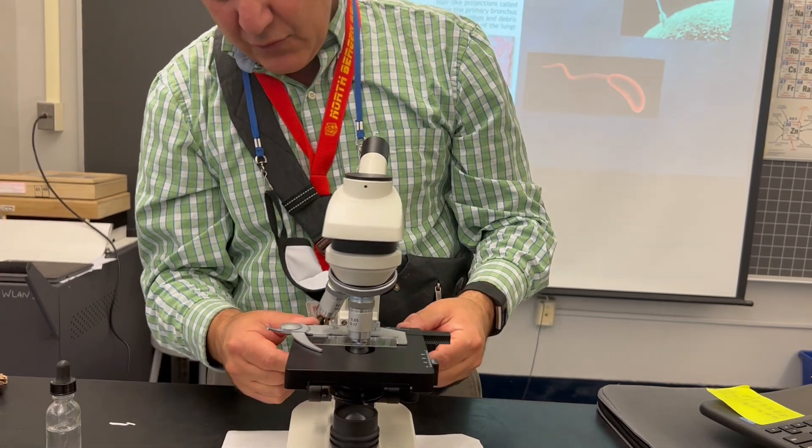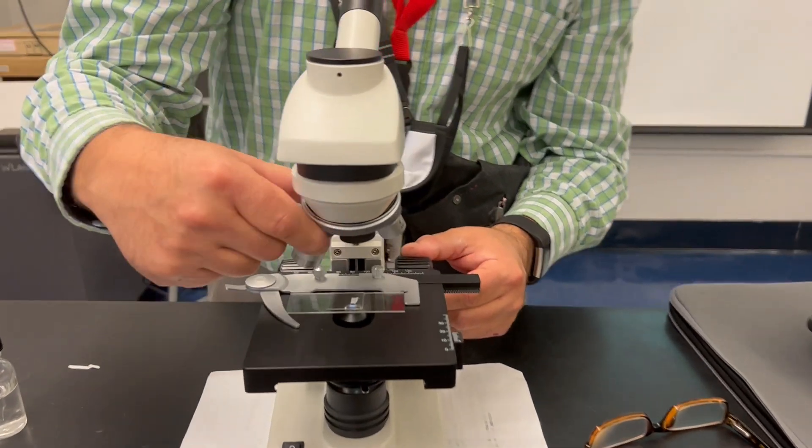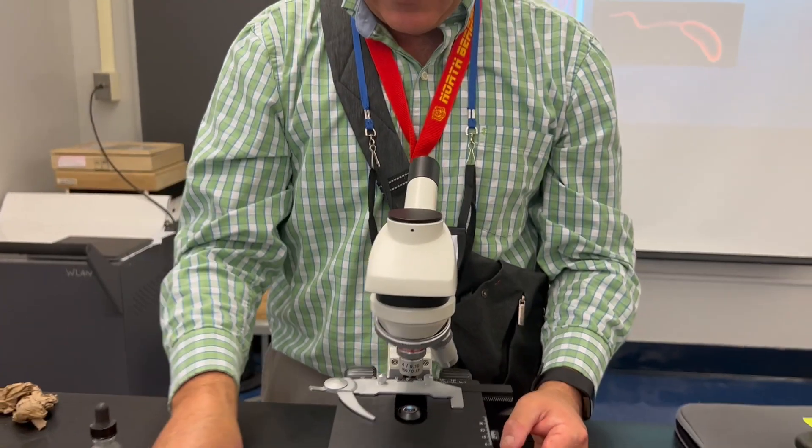When I'm done, I'm going to move my slide down and move to the lowest possible objective lens. I'm going to take my slide off, answer the questions, and that is how you make and view a wet mount slide. Thank you.